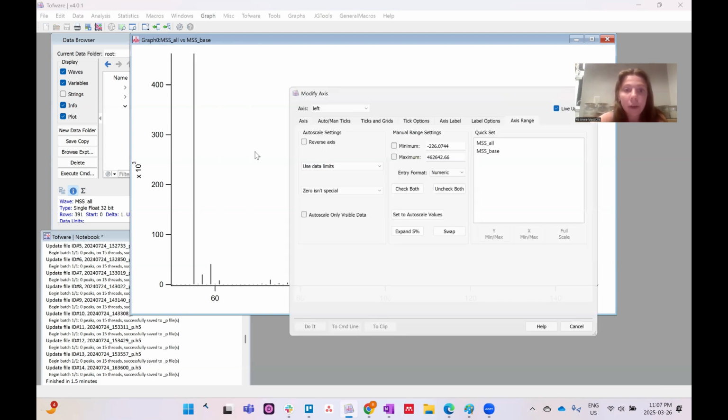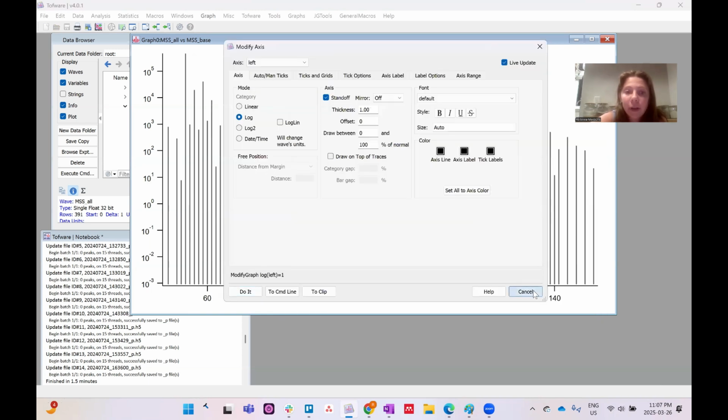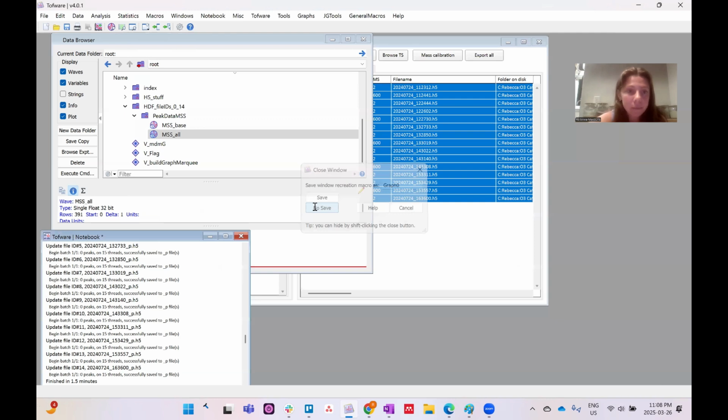Or is your idea to go into a log scale just so you can see these different signals? I don't know what your idea is. It's up to you. But hopefully from here you can develop something a bit nicer, or you can just change the scale. Up to you. Looking forward to seeing what you come up with. So that is task number 1 completed. I'm not going to save this.